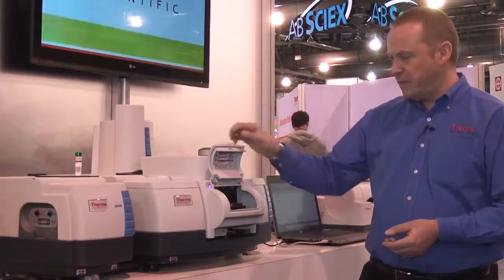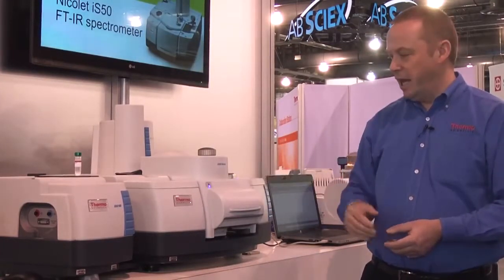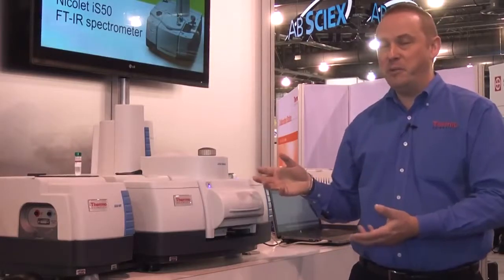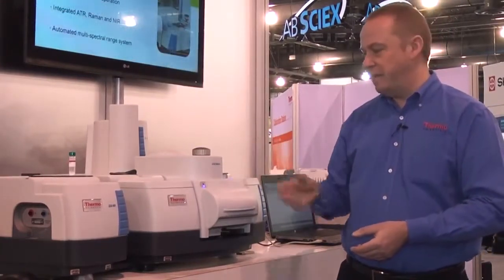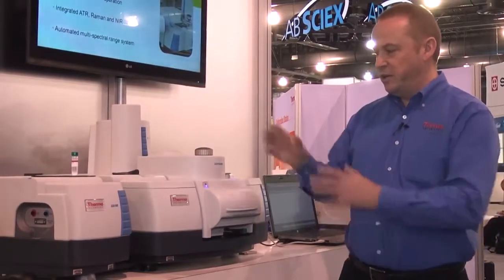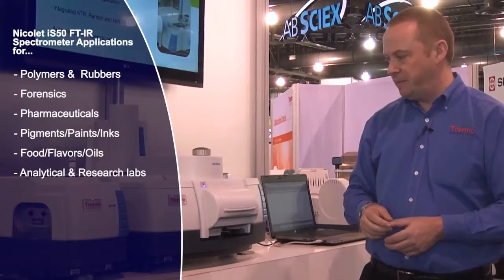That accessory, of course, being in the sample compartment, can be easily removed and replaced with any standard infrared sampling accessory that would fit in the main sample compartment of an FTIR spectrometer.